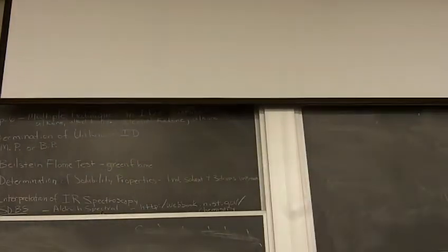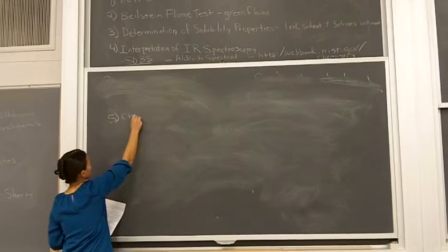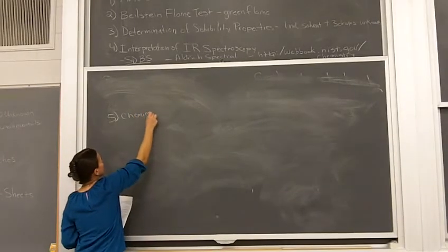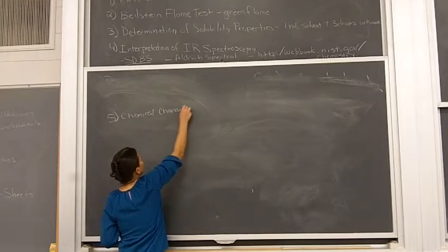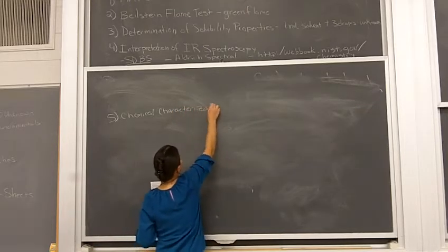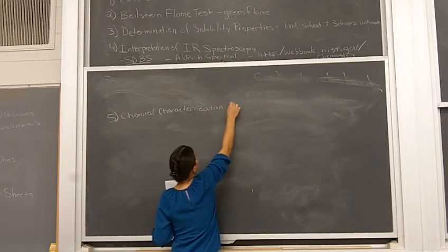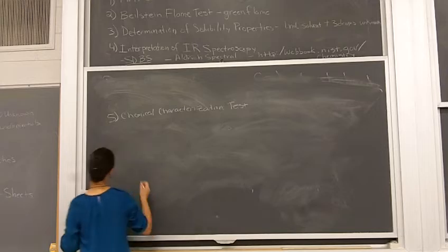All right, the next piece of information is our chemical characterization tests. And we have 4 of those.